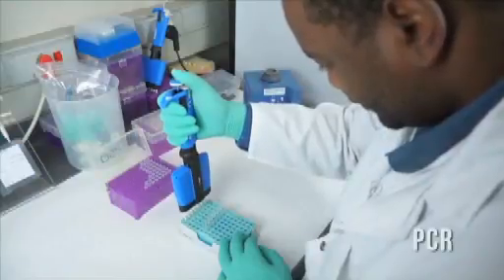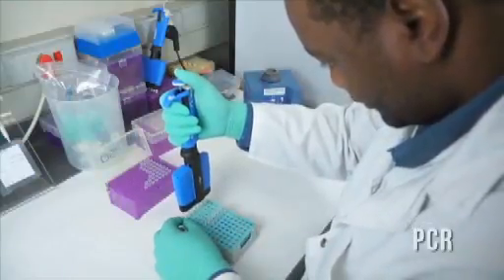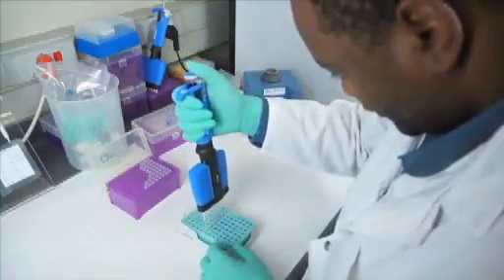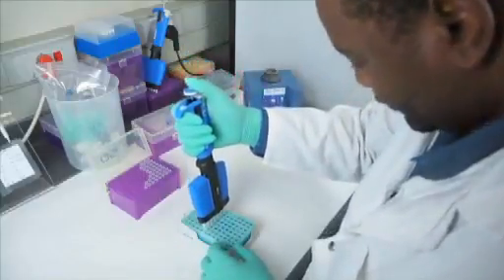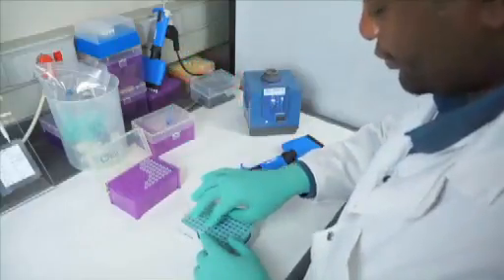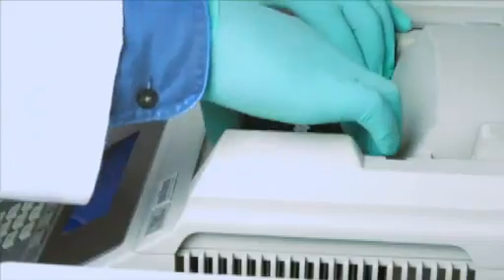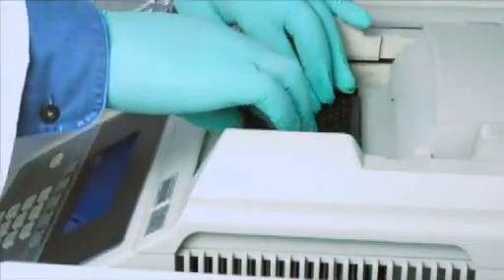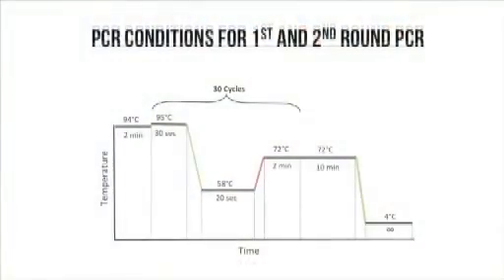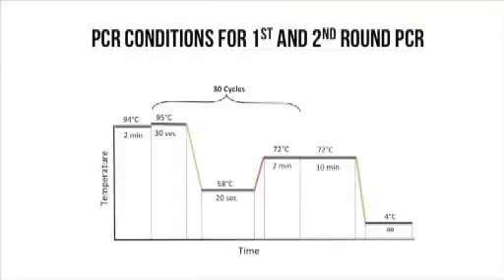Add 2 microliters of the cDNA to 23 microliters of the first round PCR master mix. Close the tubes, put the samples in the thermocycler and run the PCR program. Continue to second round PCR stage or store the first round PCR products at minus 20 degrees Celsius or colder until required.